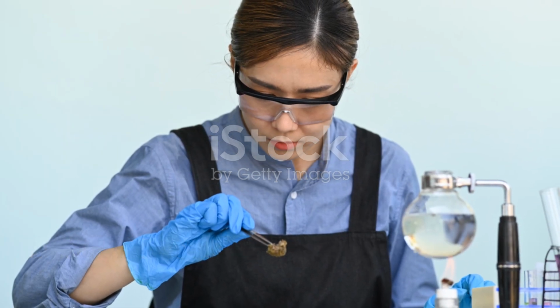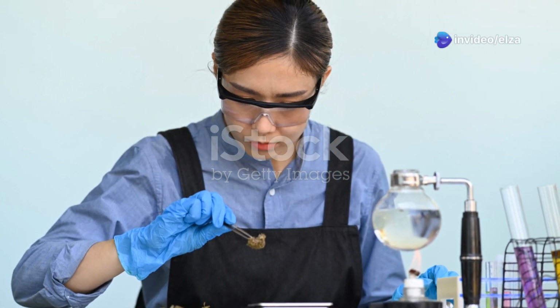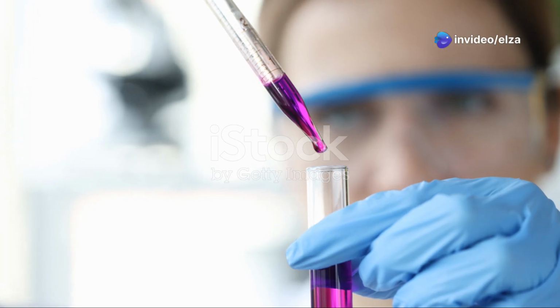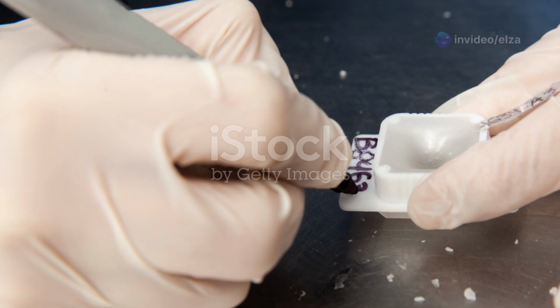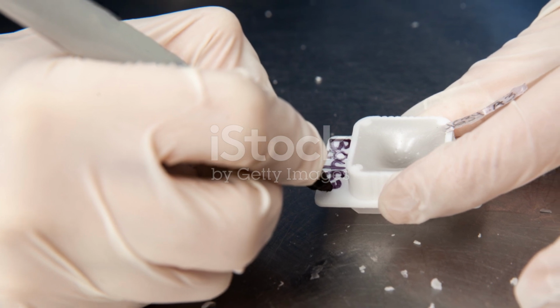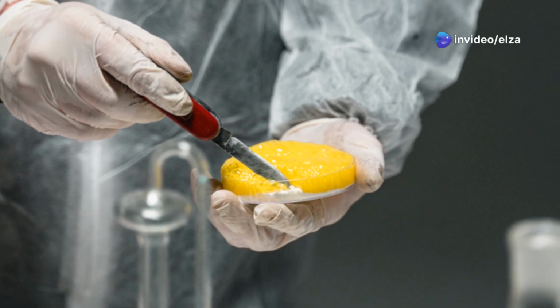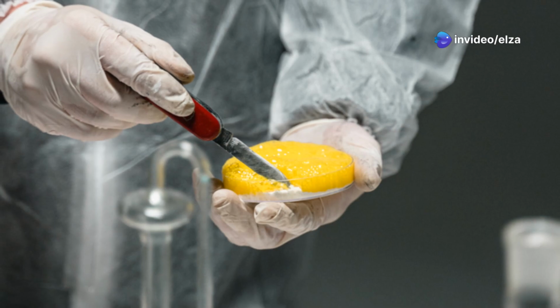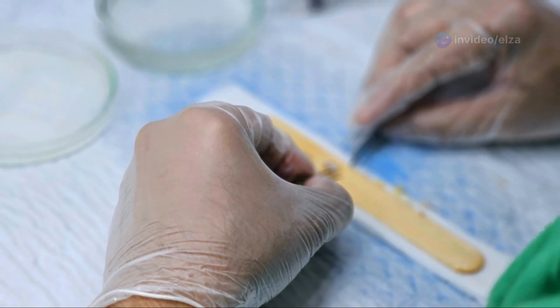The process of autoradiography involves meticulous preparation and execution. Firstly, the sample is fixed using chemicals like formaldehyde to preserve its structure. Then, it's embedded in a medium like paraffin wax to provide support during sectioning. The sample is then sliced into thin sections using a microtome. These thin sections are mounted on glass slides, ready for the next steps.